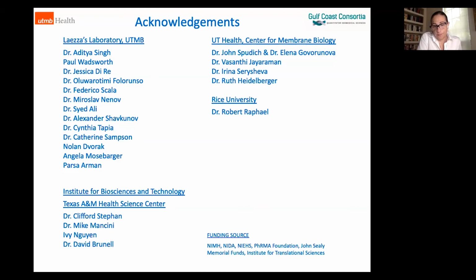We had another question that came in, and to paraphrase, you mentioned a little bit during your presentation about the PortaPatch, which you have, and the question is asking what various research areas you've used the PortaPatch with. Okay, so yes, we have it. The problem is that it was ordered a couple of weeks before COVID-19 shut down, and so it was actually delivered much later. So we are just working on it now.